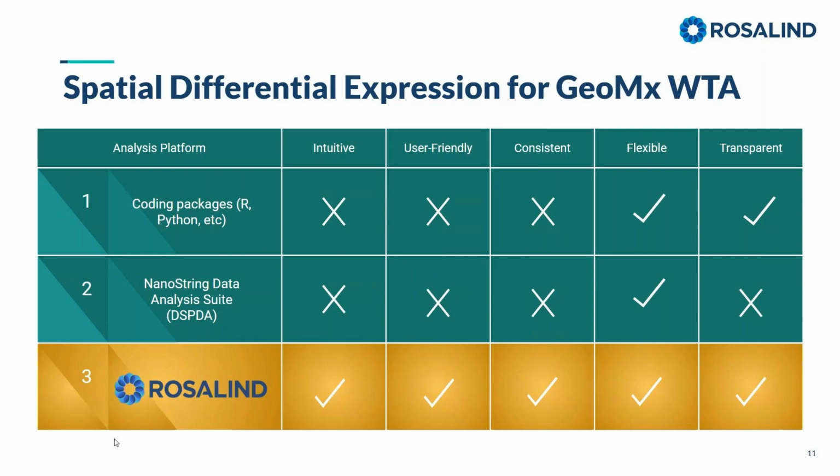They do offer flexibility in choosing various models, and with coding packages, it is often transparent what's being chosen, but you don't understand it unless you've set aside the hours to become an expert in both spatial and statistical knowledge to understand what may best fit your model. Otherwise, this can be a very black void, and you may not understand the implications for your data.